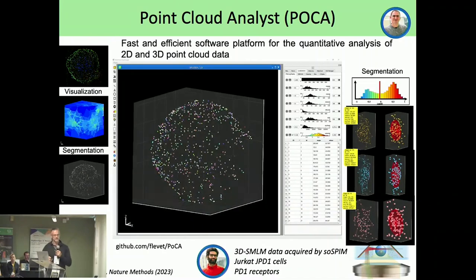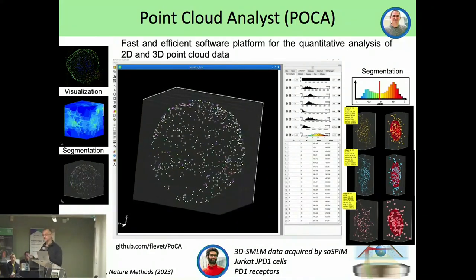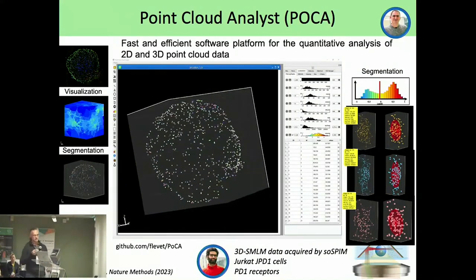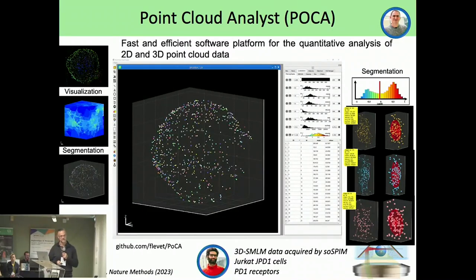Okay. But we also thought it was interesting to analyze not only the clusters by themselves, but the distribution of the clusters. You can say, okay, every cluster, which is a group of localizations, possibly a group of molecules, has a spatial distribution. And we know that in 3D this can be interesting, for example whether you have a polarization, because it's not like a 2D flat surface. Now we're talking about 3D. So something can of course be non-isotropic in its distribution.